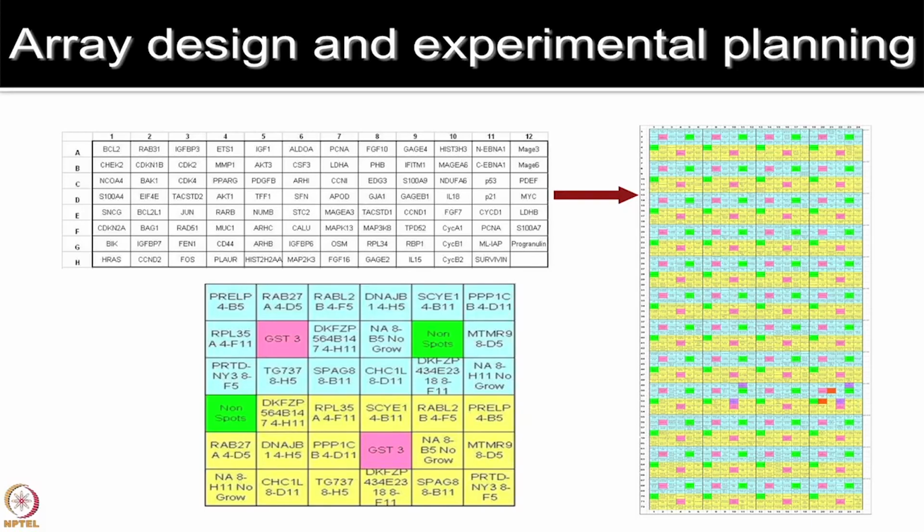Shown in the slide is one of the actual screenshots from the printing which we were doing. It shows how you are making your 96 well plate where the DNA will be placed, and eventually after printing how the slide will look on the right hand side, and then one of the blocks I have highlighted in the panel below.